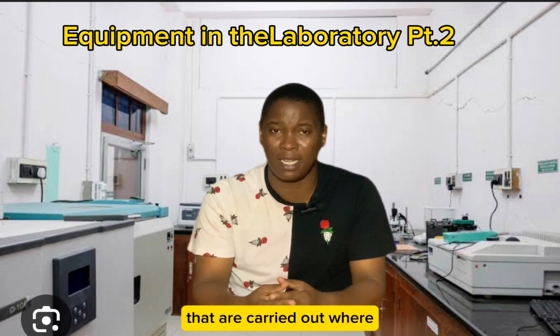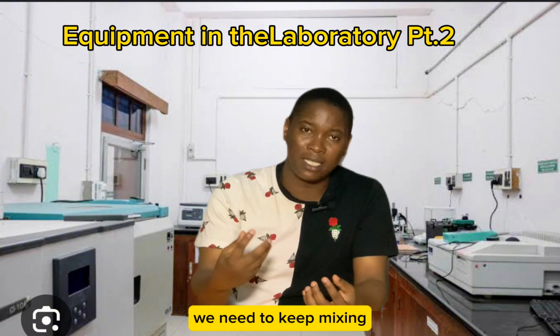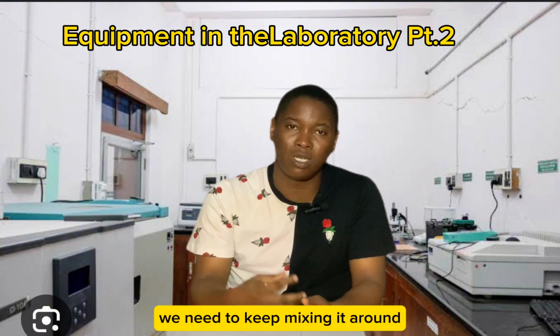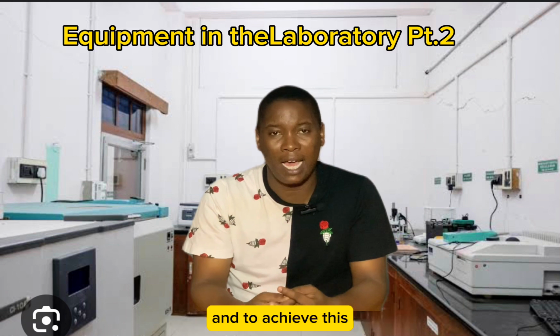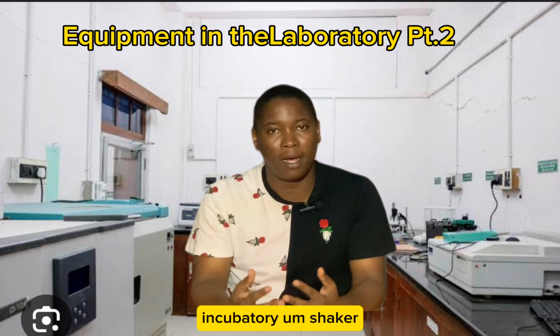There are some experiments that are carried out where we need homogeneity. We need to keep mixing whatever we are working with. We need to keep mixing it around. And to achieve this, we have this incubatory shaker.